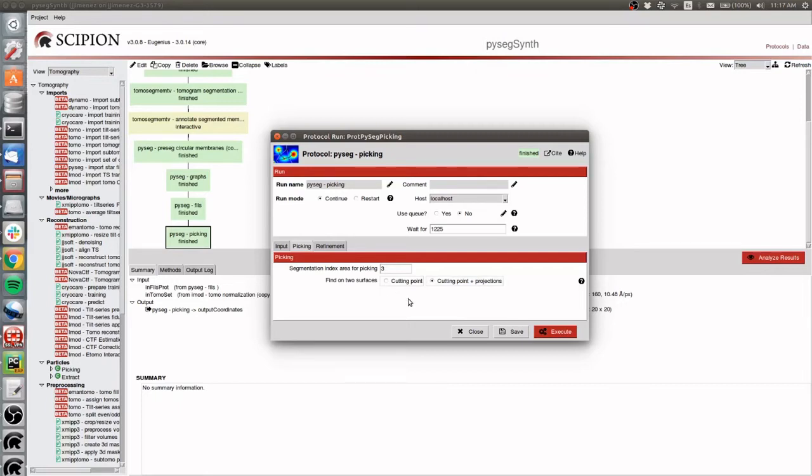Depending on the case, if your particles are very difficult to observe, maybe this option is the best, and you can, after the classification, clean the classes and so on. But it depends on the data and trial and experience to get the best results. So we encourage you to try this and acquire that intuition to find the best combination of parameters.